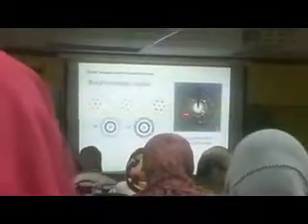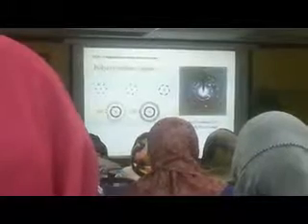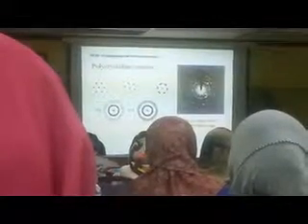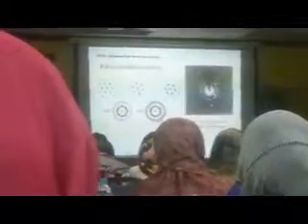But when you focus your beam on many grains, you will get a ring pattern. Why you get this, you have to solve it. This is like a puzzle. You have to solve this spot pattern. You have to solve this ring pattern to find out what crystal structure has resulted in such a pattern, and to find out the lattice parameters. You can really do the calculations in the TEM. And that's all.